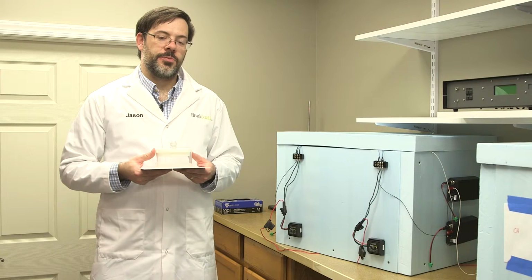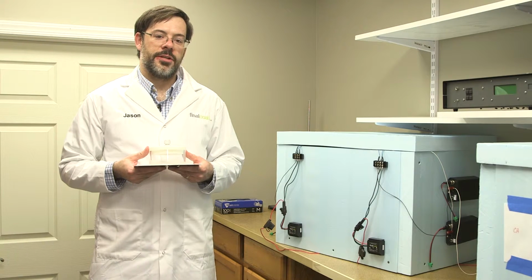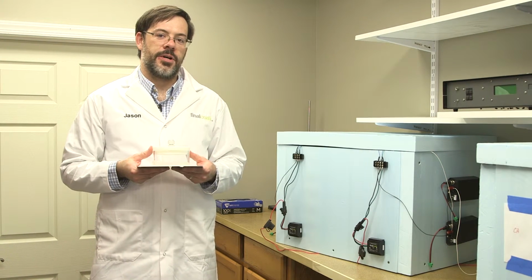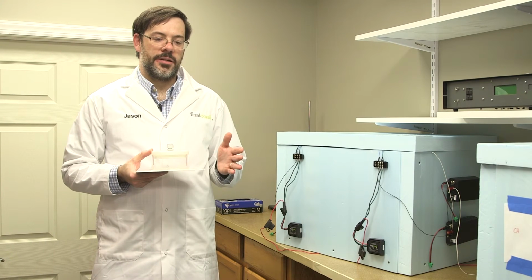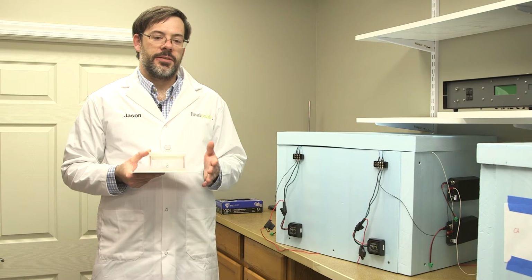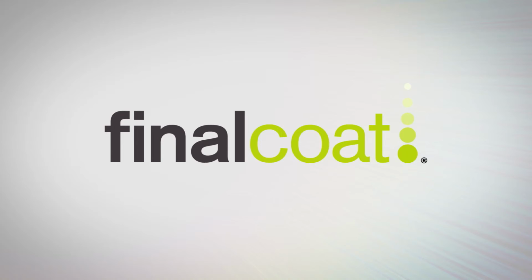The difference between those corrosion potentials can be used to directly calculate the relative rates of corrosion that you get with and without the module. So by taking that computation, you can say the rate of corrosion is this much less when you use the module. This is a much more direct measurement than we get in the Q fogs.